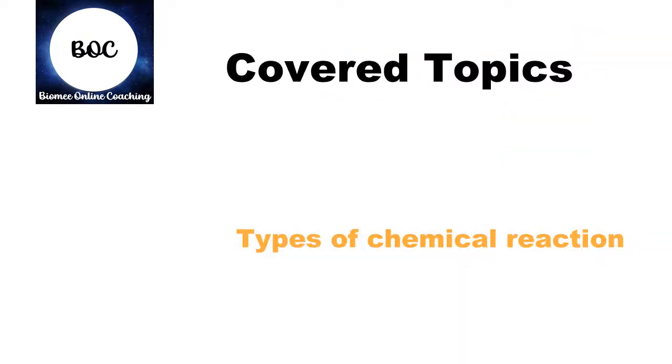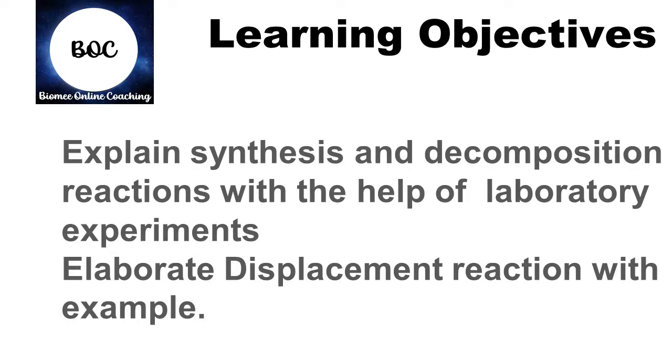In this video we will cover types of chemical reaction. And these are the learning objectives. Explain synthesis and decomposition reactions with the help of laboratory experiments. Elaborate displacement reactions with example.